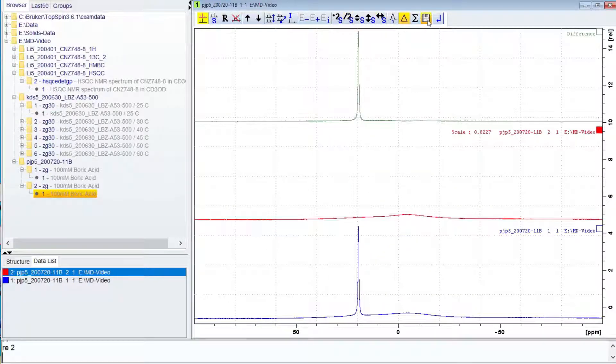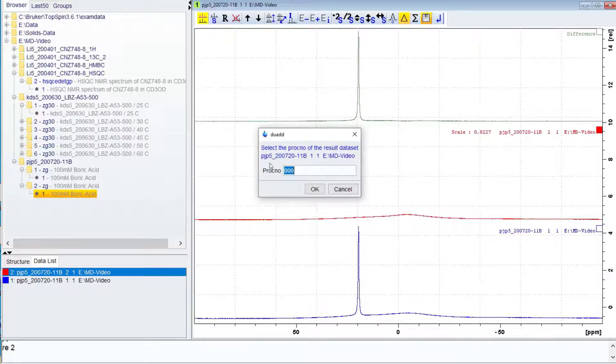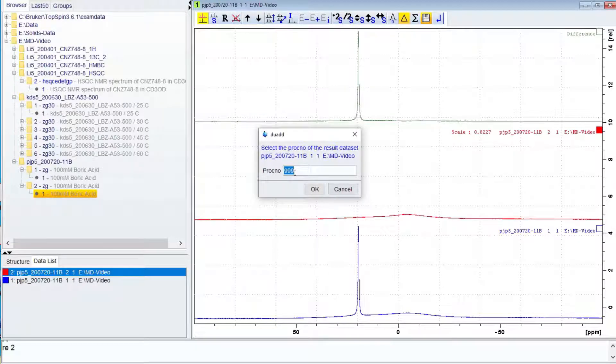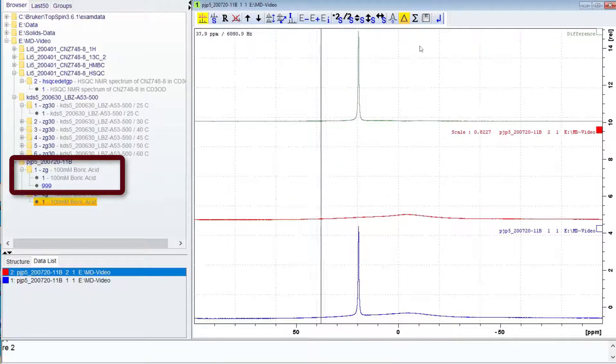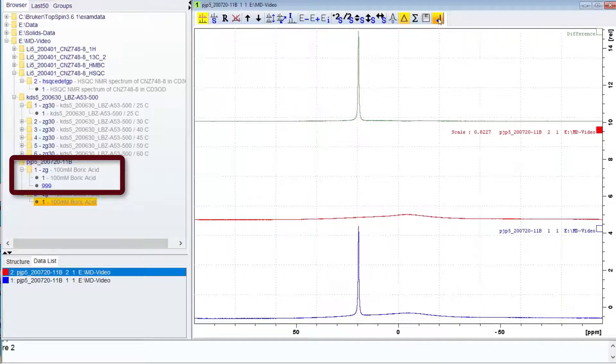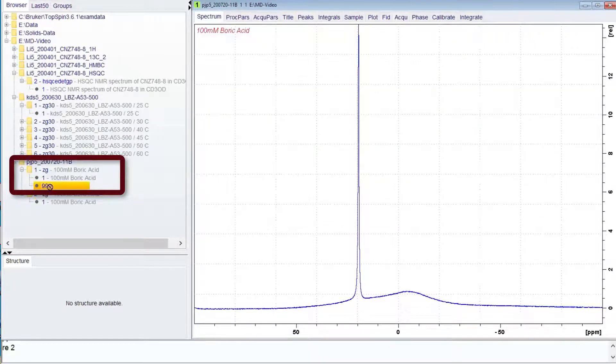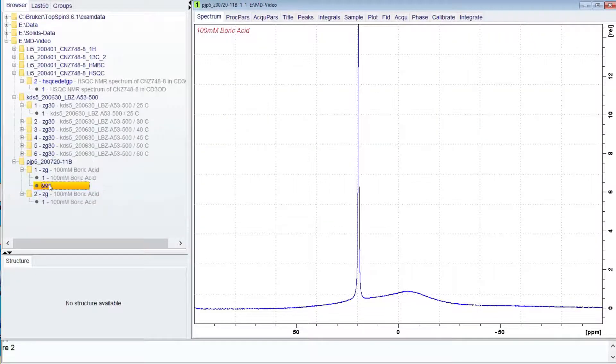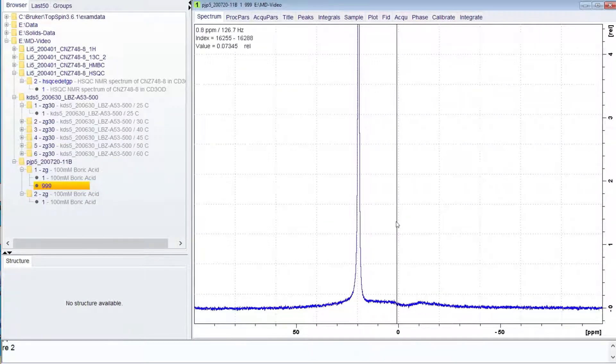The result can be saved with the button with the floppy disk icon. It will be in the same main folder but with a different processing number. The default is 999. The result can be further processed and plotted.